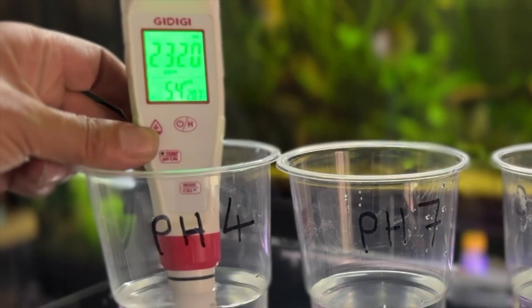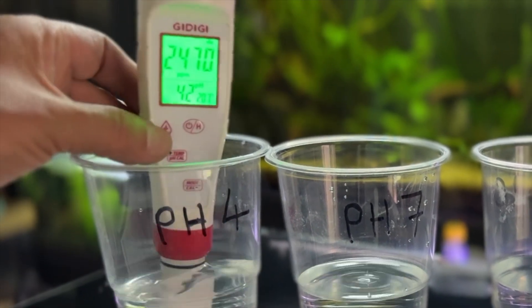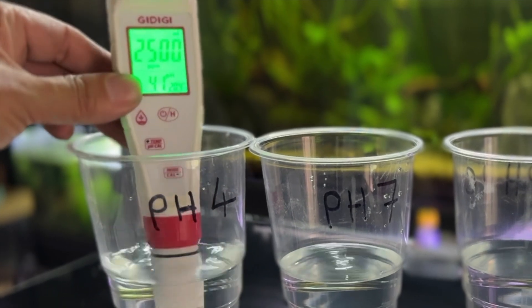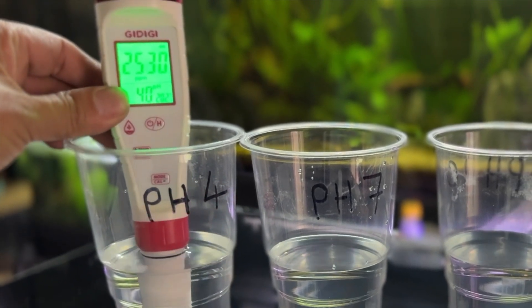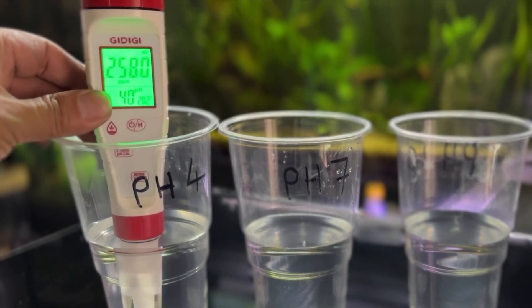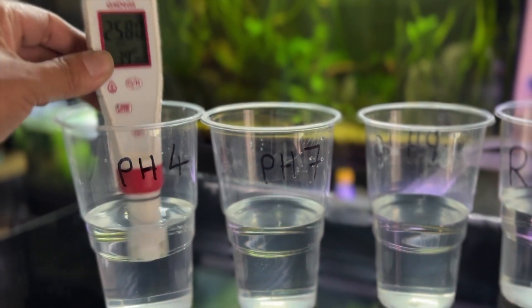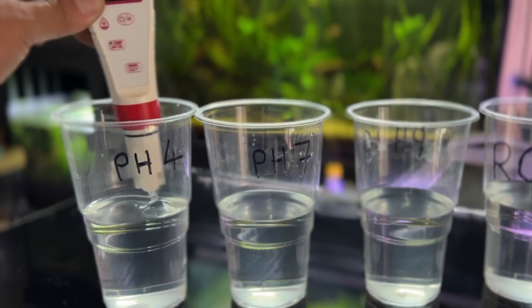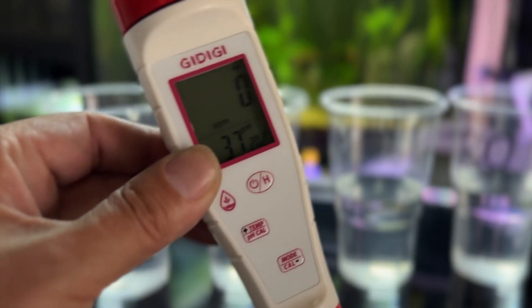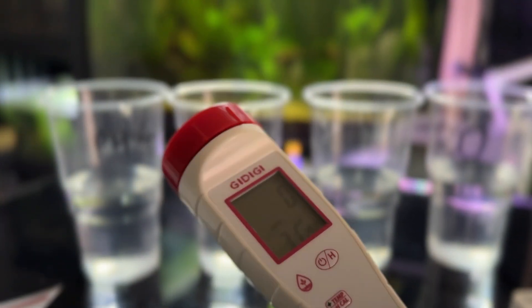pH 4. There you go — pH 4. Can you see that? It went down to 3.9. So the device itself is well calibrated out of the box. That was just to test, just to make sure.